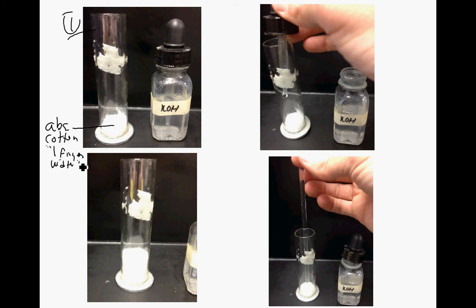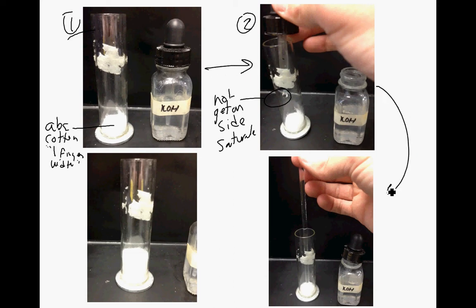Step number two, you're going to saturate the absorbent cotton with KOH. So here I am dropping the KOH in there. You want to be careful not to get it on the side of the chamber. Make sure it drips straight down into there, and you're going to saturate that. This is anywhere from a dropper full to a dropper and a half to get that cotton saturated. Step number three, you're going to use this glass stirring rod to tamp down the absorbent cotton in the bottom.